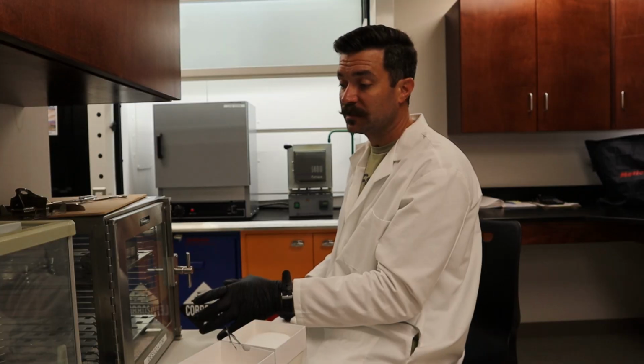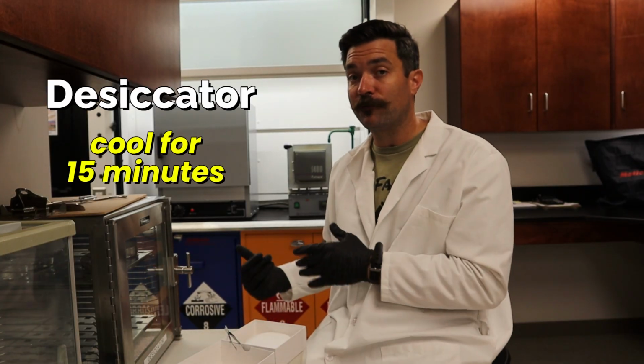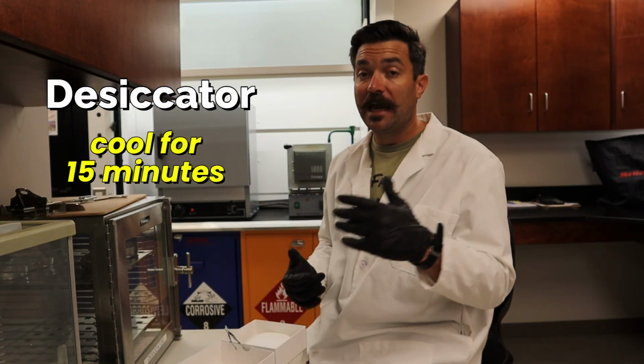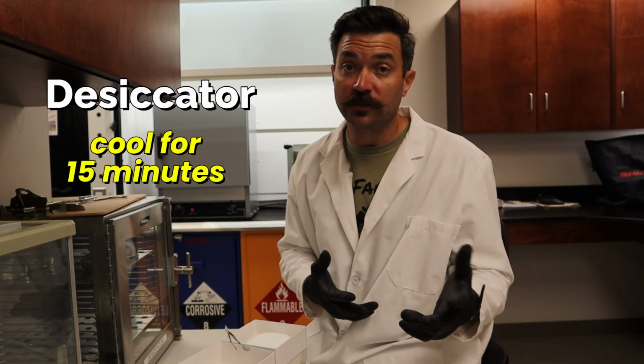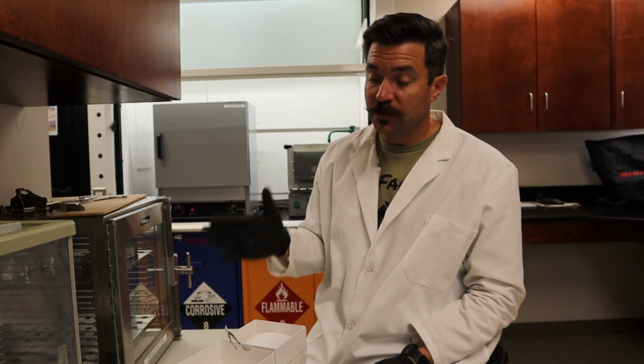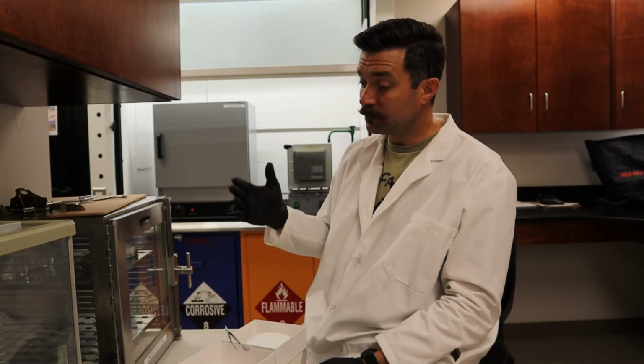So putting it in the desiccator for 15 minutes after it leaves the oven before it's weighed is a very important part of it, and you will see that potentially on your exam, especially your lab analyst exam. Once it is cooled in the desiccator and then you have re-weighed your sample, you now have the numbers you need in order to solve for your mixed liquor. We'll get to that later on in the video.